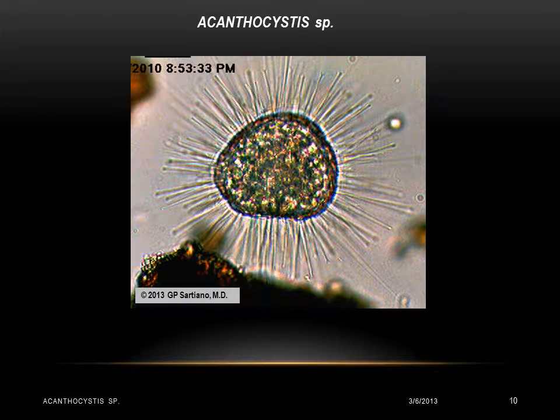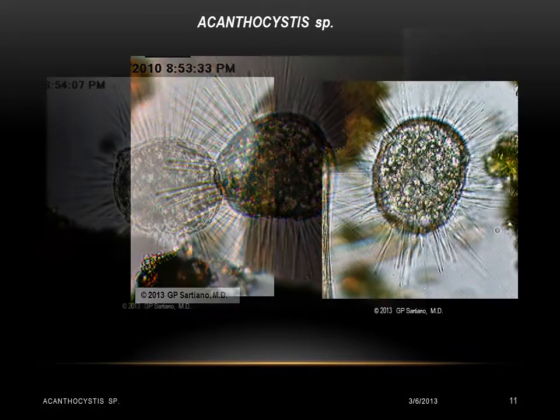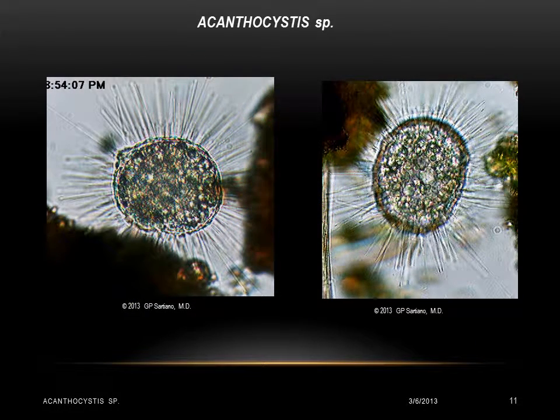Unlike marine radiolarians, which it superficially resembles, Acanthocystis does not have a rigid internal siliceous skeleton. Thus, it is able to a limited degree to change the general outline of its shape, presumably sliding and moving some of its scales and spines in the process.